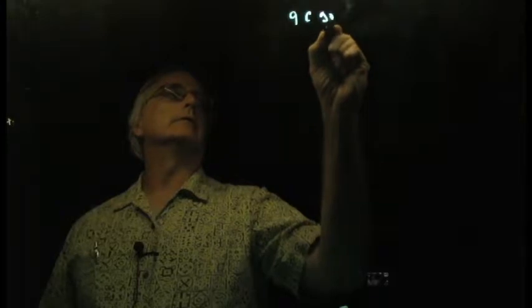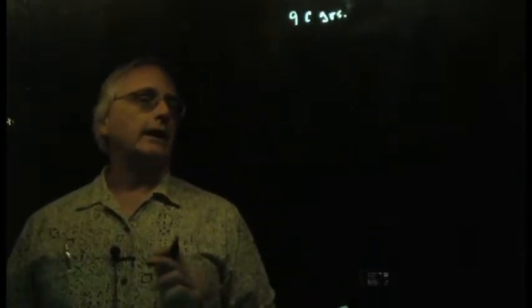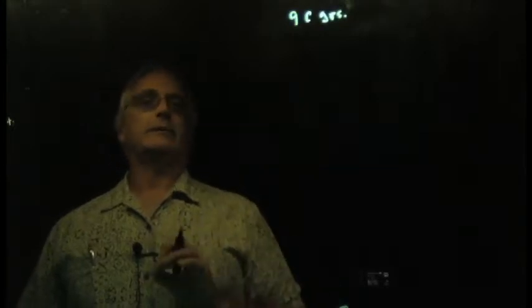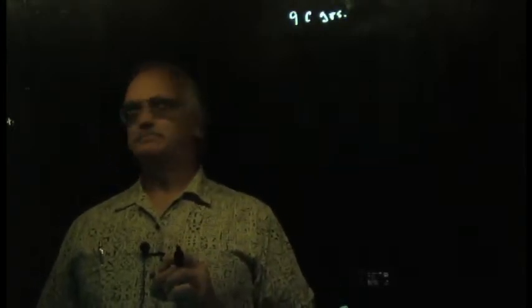Now, I'm going to go ahead and look at the number of carbon groups as well. I seem to have 9 carbon groups, so at least 9 carbons, and by symmetry, maybe even more than that. So this is a fairly substantial molecule.